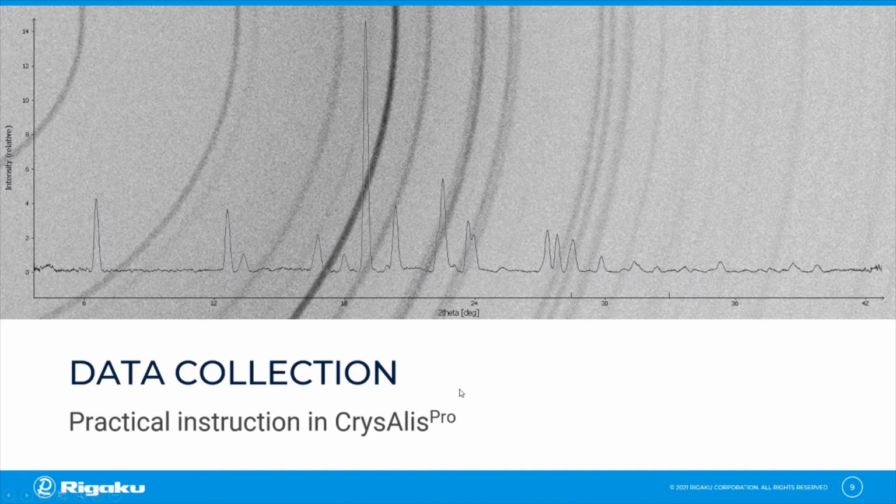So next we would mount the sample and start an experiment. Therefore, let me switch the screen and start CrysAlisPro.